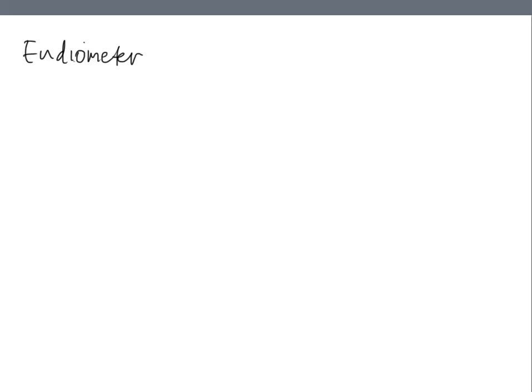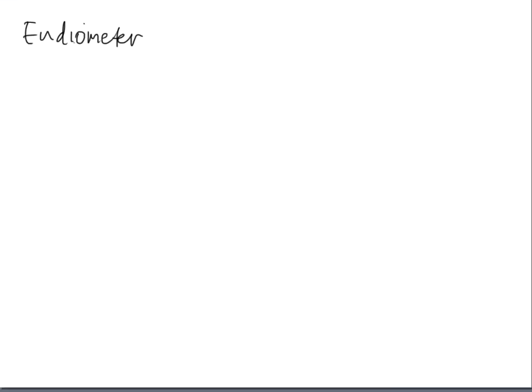Eudiometer. Eudiometer. That's what we're going to be focused on. And you felt fancy and you clicked on this lab, and I'm going to show you a fancy lab.